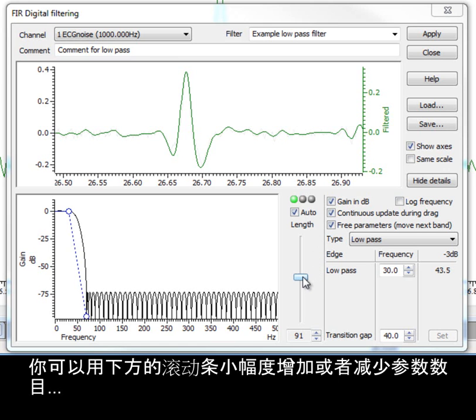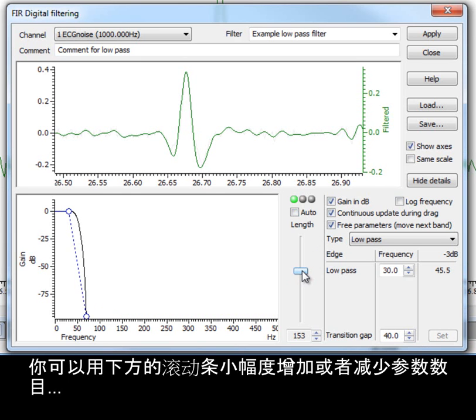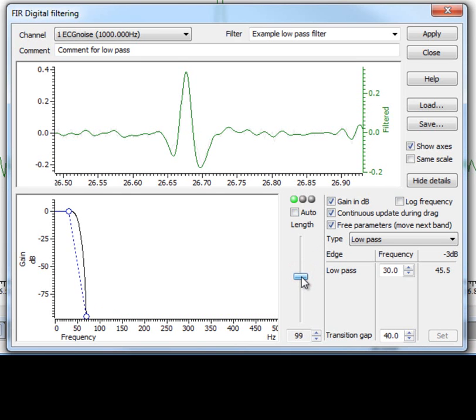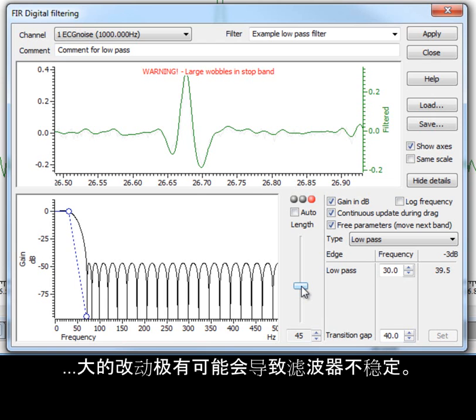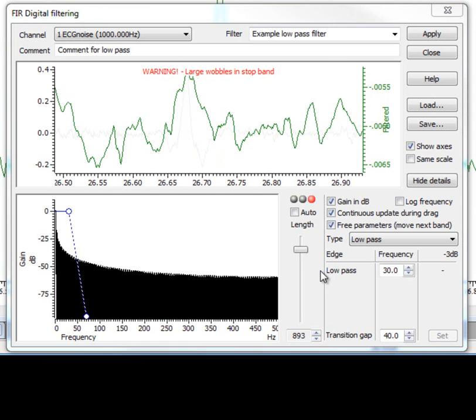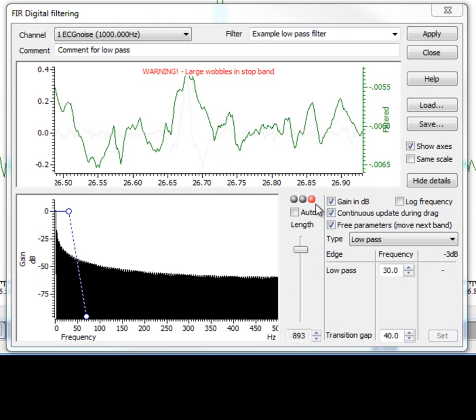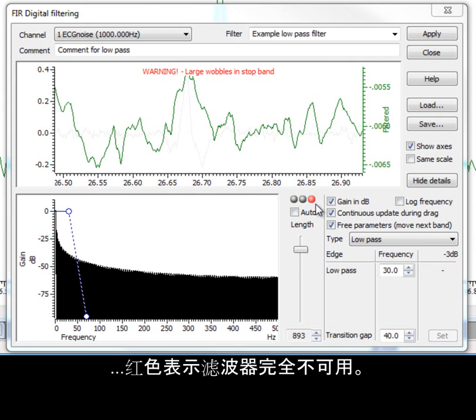You can make small adjustments to increase or decrease the number of coefficients using the slider below, but large changes can easily produce unstable filters. The traffic light system above the slider displays a green light if the filter is good, amber if the result is not ideal but still usable, and red if the result is no good at all.